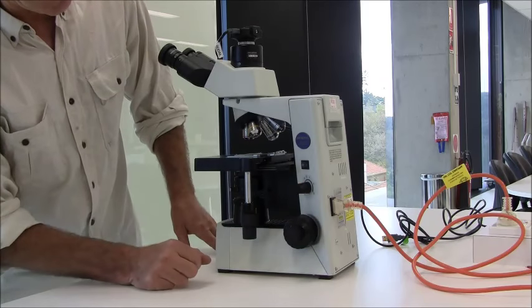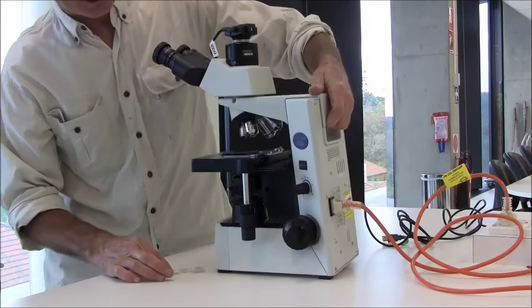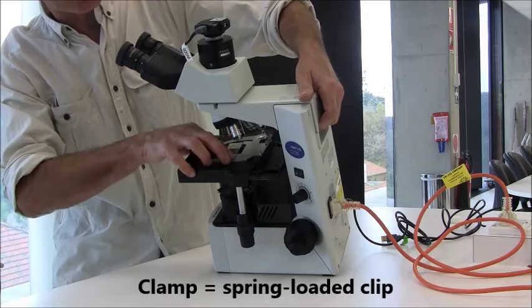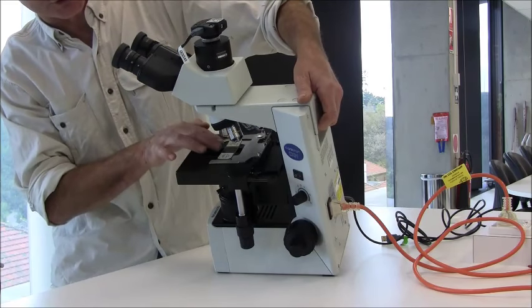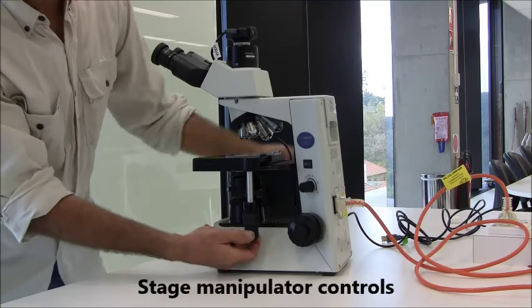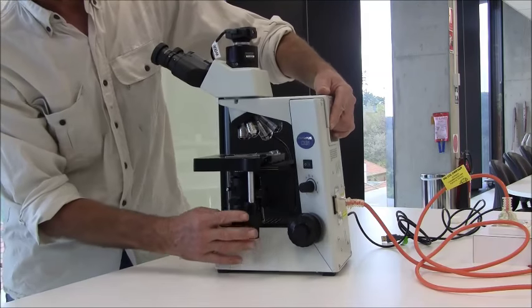Next you have what's called the stage, where the microscope slide is clamped. There is a clamp here where the slide can be securely positioned. A lot of students don't quite get it clamped in properly, so pay some attention there. And then these are the stage manipulation controls — you can move that specimen around side to side, back to front, very accurately using these controls.